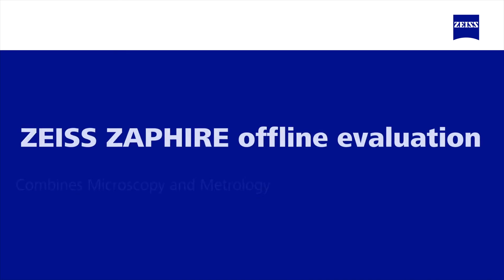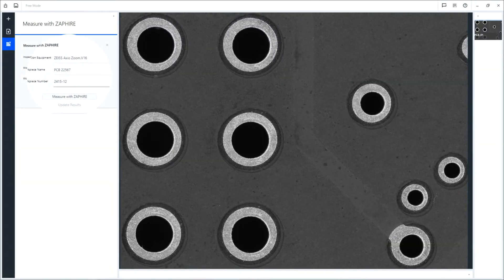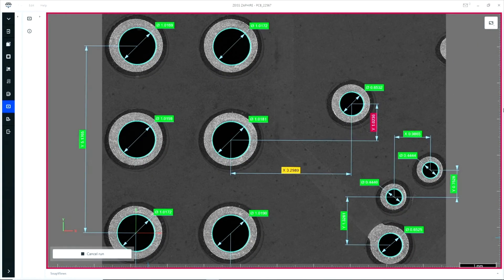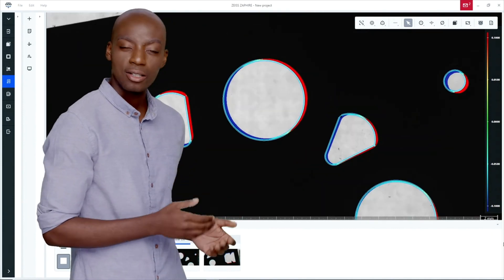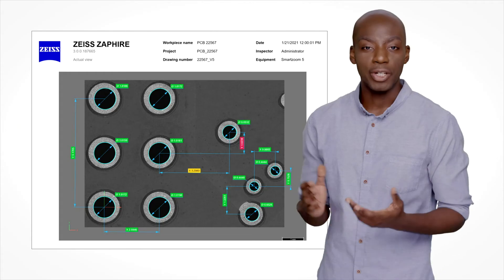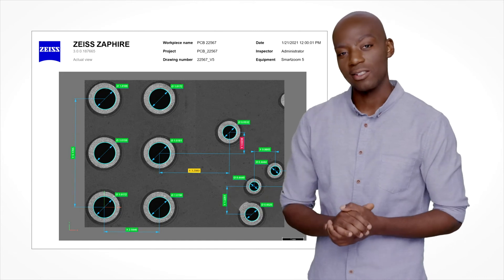Wouldn't it be great to have a solution that measures your microscopy images automatically with reliable user independent results? Send your image with the click of a button — your corresponding inspection workflow will start immediately. The software automatically performs predefined measurements. You can then compare your measurements with CAD data to check for any deviations, and get all the necessary information at a glance in just a few seconds.